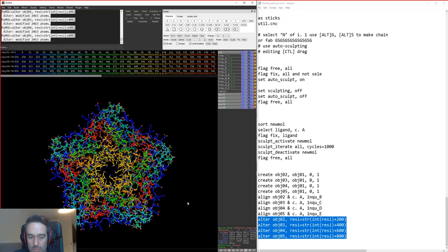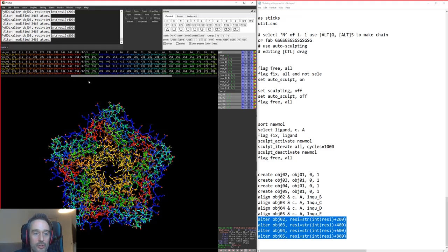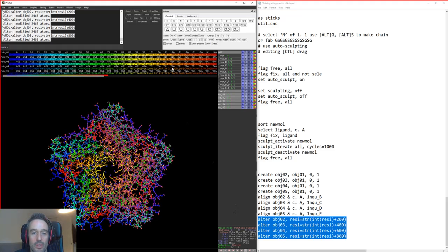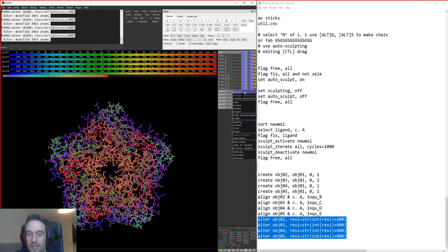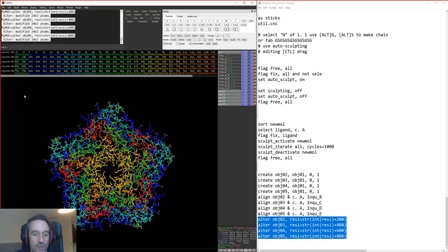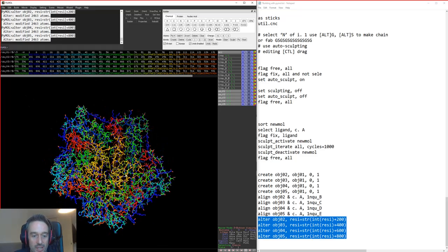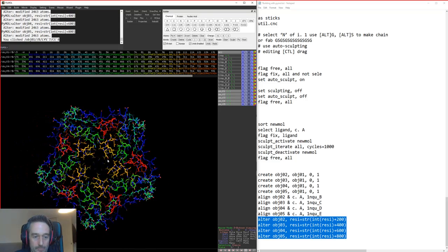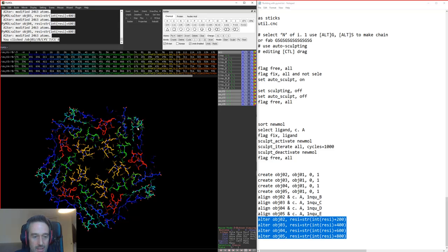And then basically we've now got 5 models, and each model has got 2 chains, and the second chain has got our extension on it. So actually our first chain is completely unnecessary. So what we can do is take our first chain of each of these models and remove those atoms, and that now leaves us only with the last chain of each of those models, but each of those has this extension. So you can see that we've got now five copies of our extended section here, linking between the N and the C's.